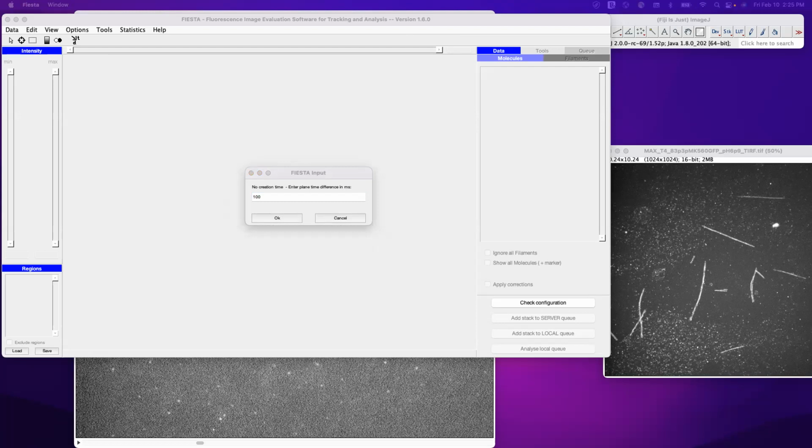Yeah, so 10 frames per second, 101.18 milliseconds. So 1.18, exact value. Yeah, so the 1.18 milliseconds is for the transfer of frames. The pixel size is 58 nanometers on the Nikon.